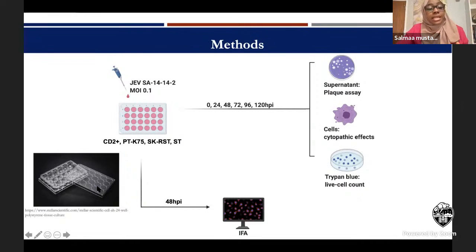So I put this plate here just to show you that you don't have to use the fancy plates and slides that I showed earlier when I was troubleshooting, because those are really expensive, okay? When I was troubleshooting, I used the regular 24-well tissue culture plates to do my troubleshooting of antibody incubation and all of that. Once I established my protocol, then I moved on to the fancy plates for, you know, fancy pictures and to make my life easier, sort of.